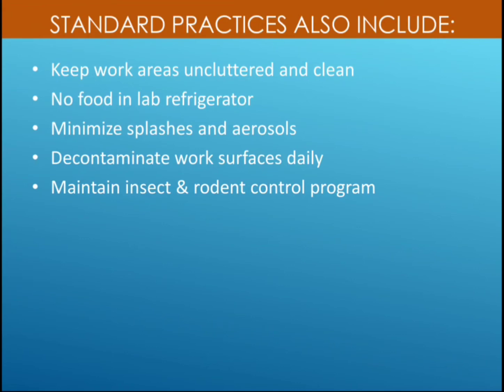No food should be kept in the laboratory refrigerator. Then we should minimize the splashes and aerosols coming out from our mouth too, and when they come from the mouth they should not travel a longer distance, so a mask should be worn by the personnel who are working over there.